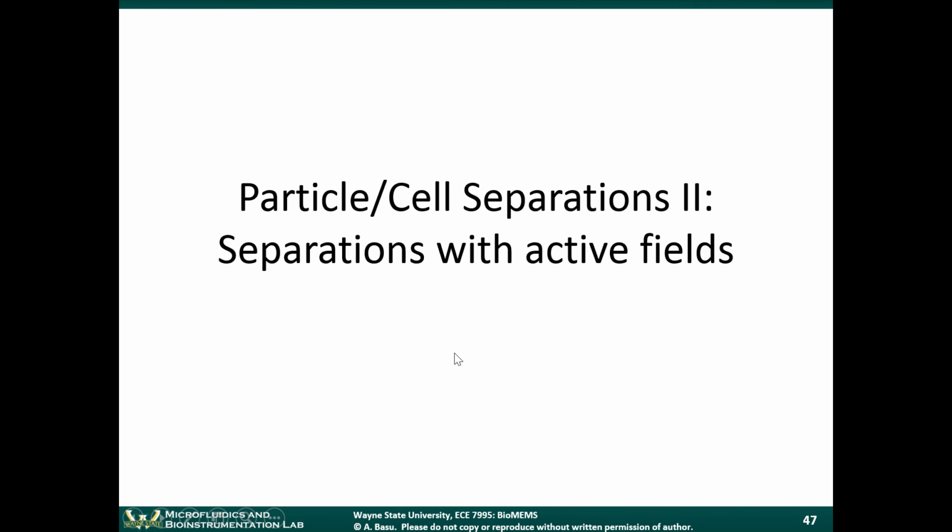So the second section here is separation with active fields. Now, what all the previous particle sorting techniques had in common is that they all relied on the interaction of the particles with the flow around them. So they were passive devices in the sense that you're not adding any electrical fields, you're not adding any vibrations into the system, you're not adding any energy other than just flowing the particles through the channel.